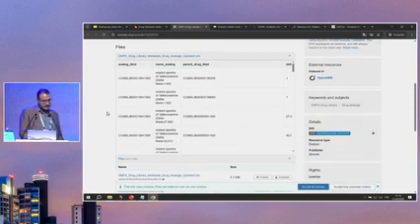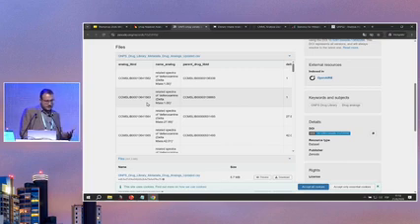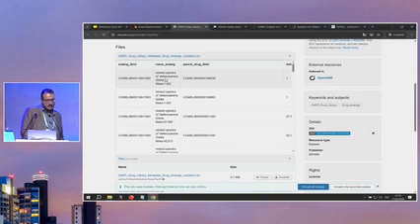If you open it, it's basically going to show a CSV file with the identification, in this case for the analogs, the name that shows there, so the parent compound that it's related to and the difference in the delta mass, and also the parent drug identification for you to do any correlations based on the annotation itself.